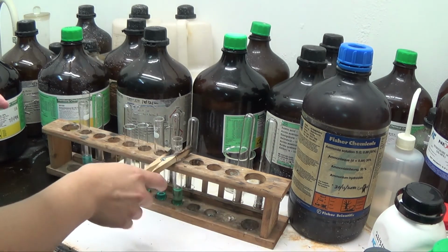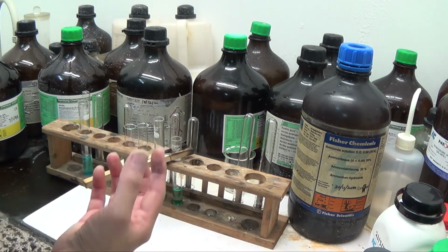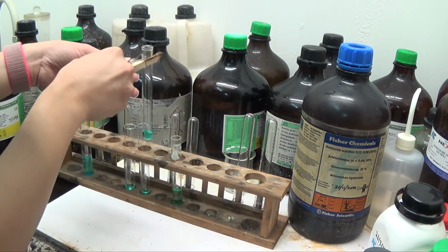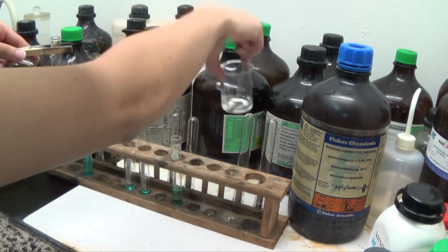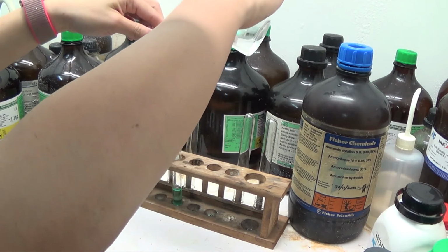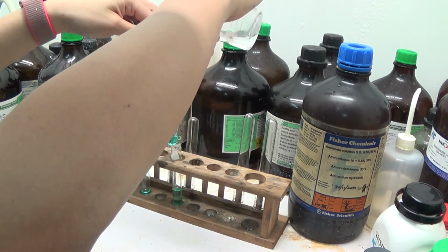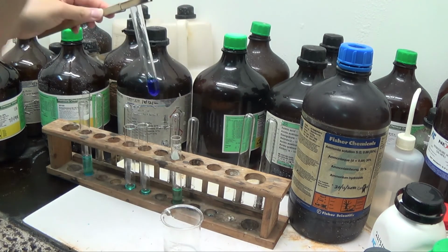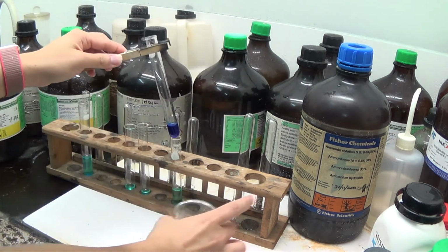I should add a little bit of ammonia. Usually we will try by adding some dilute ammonia first, but instead of diluting my solution, I'll just add a bit of concentrated ammonia, and that should work. Oh gosh, okay.